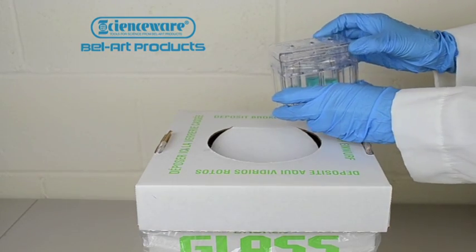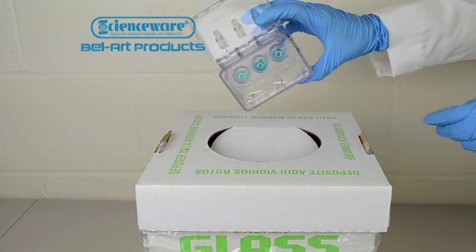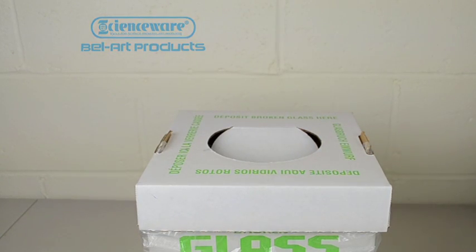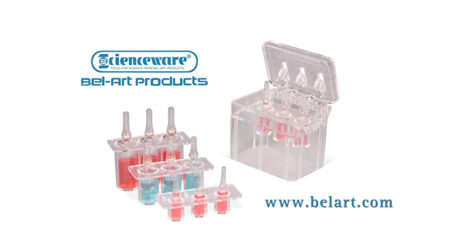When ampules need to be disposed, just turn the device upside down over a trash receptacle. Open ampules easily and safely with the BreakSafe Ampule Opener by Bellart Products. Contact your Bellart distributor or visit bellart.com.